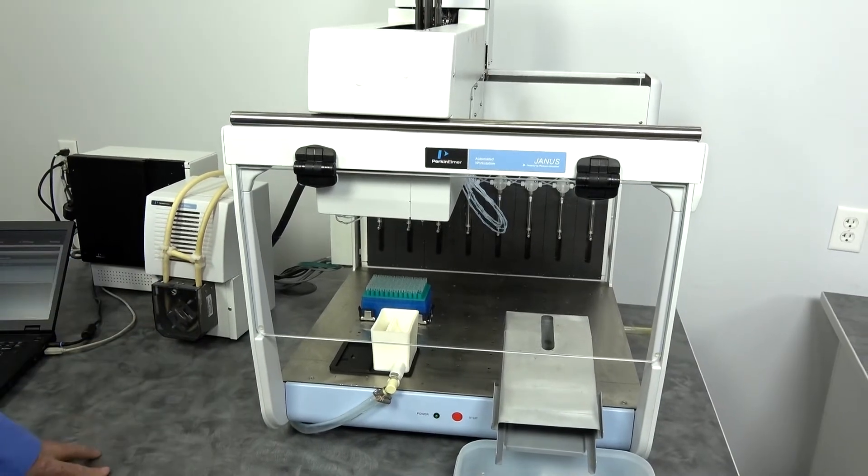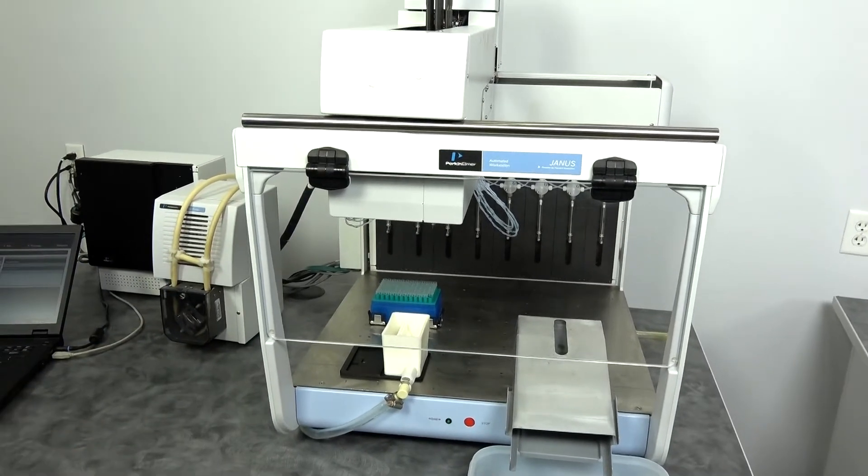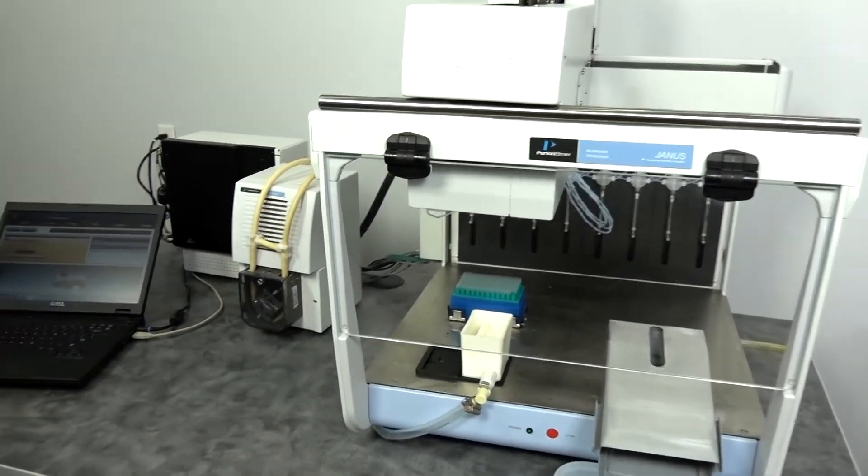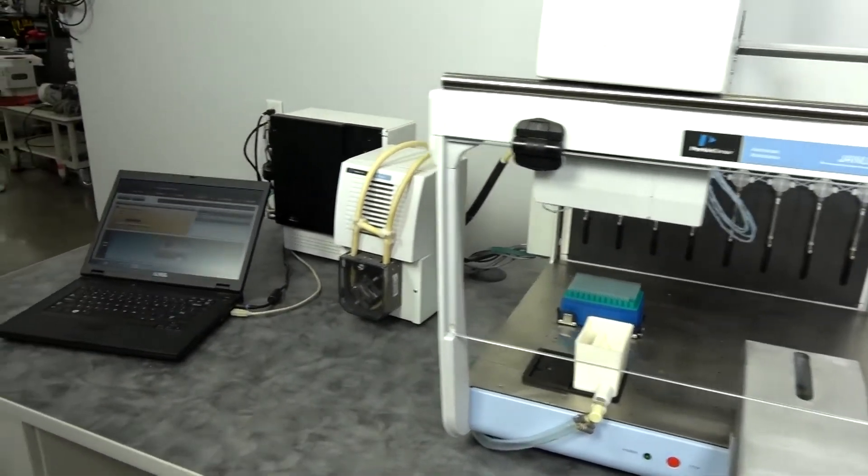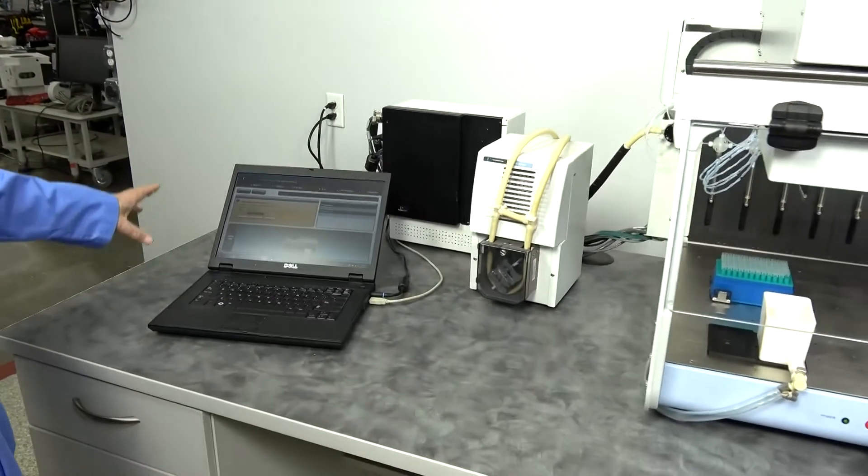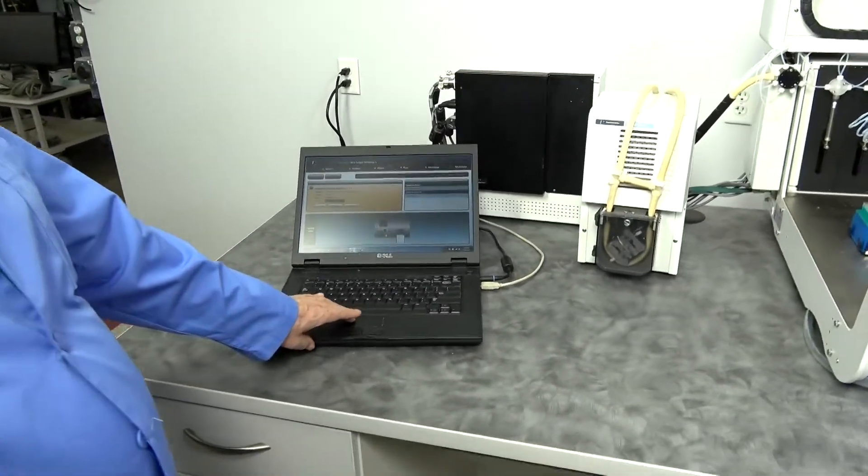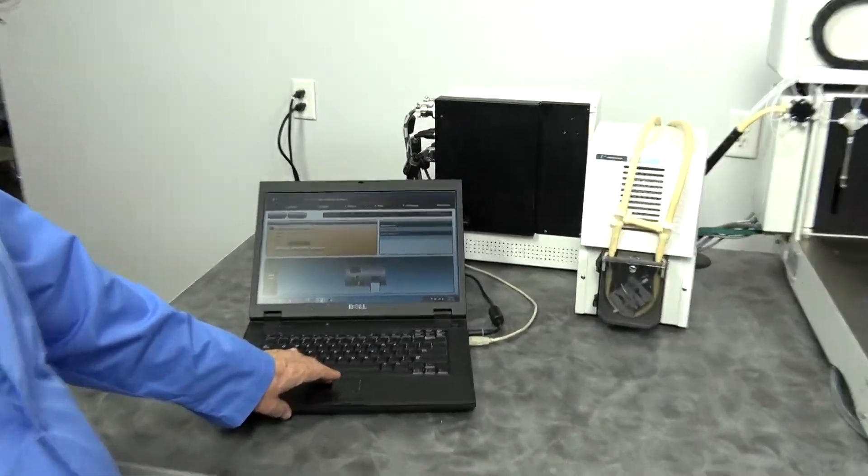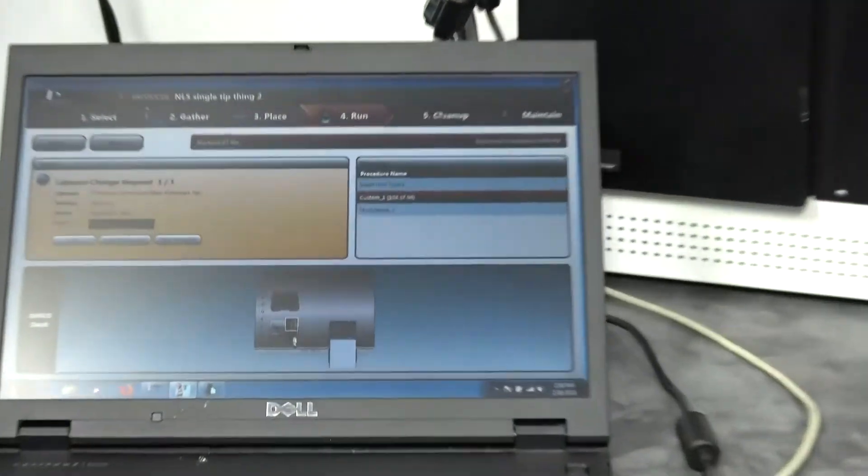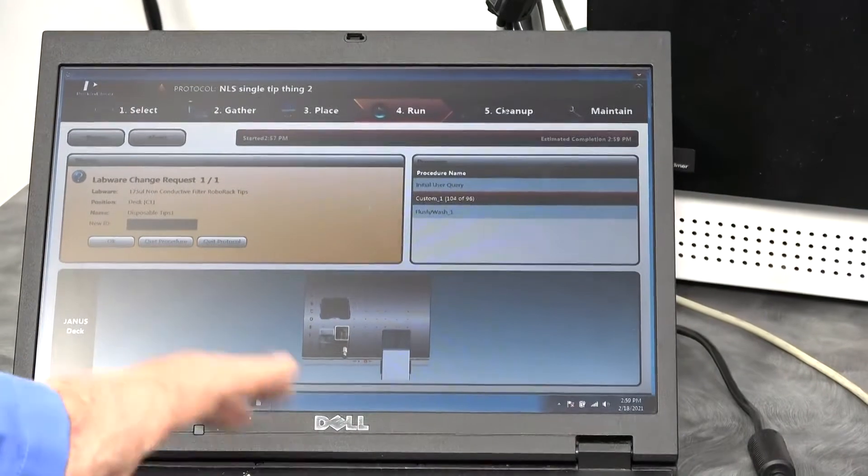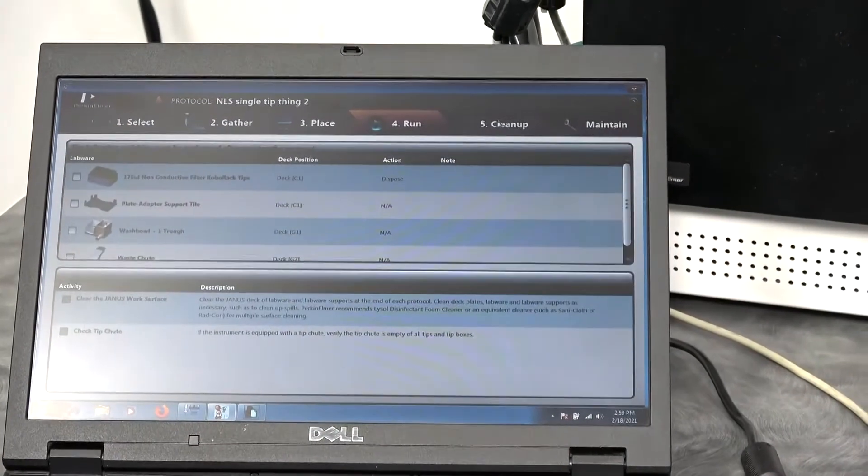There, it's completed the run. The system reports and lets you go on to complete it, quit, perform a cleanup, whatever.